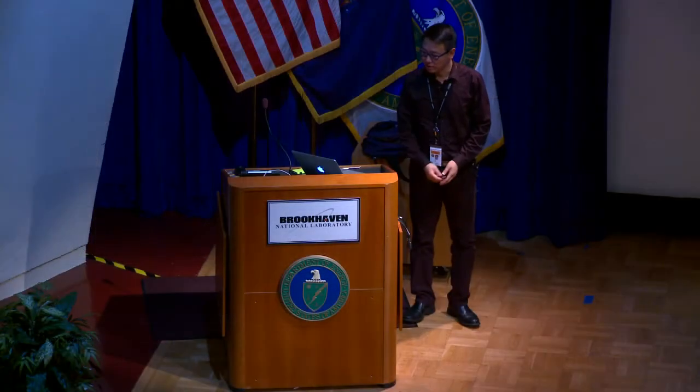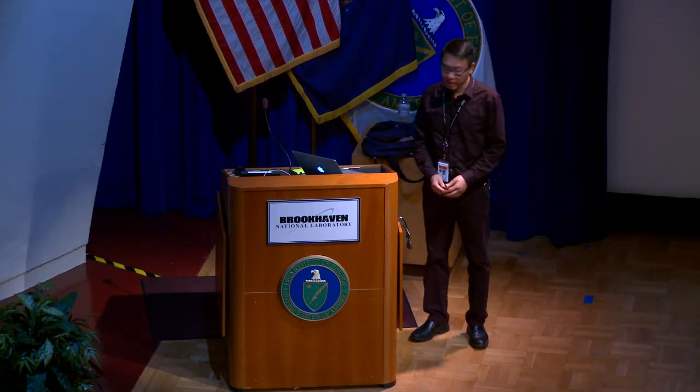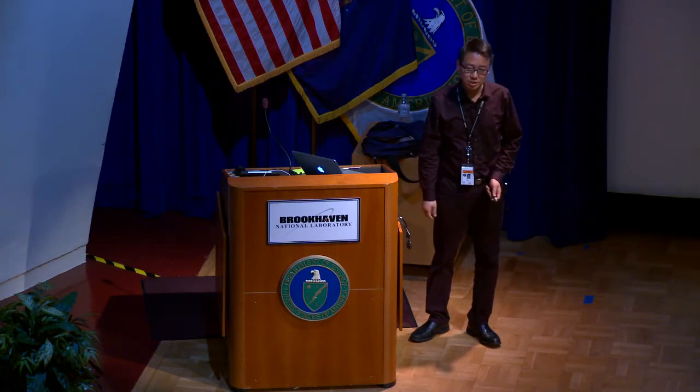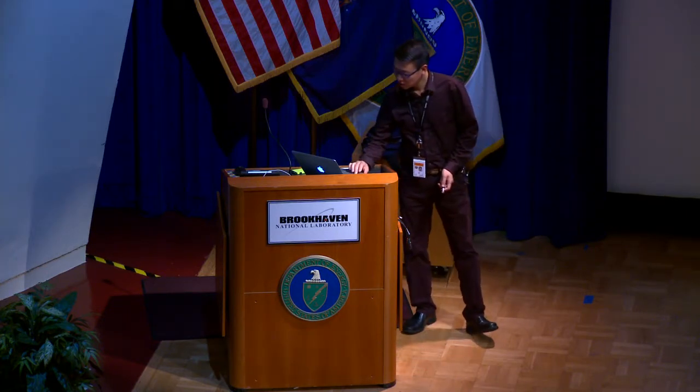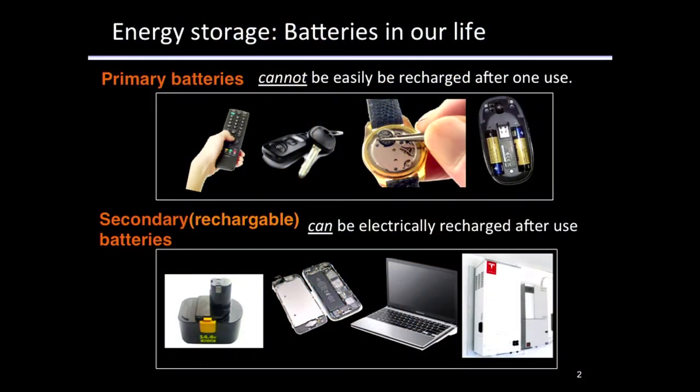This talk is about how we use the transmission electron microscopy method to study the electrode materials and their electrochemical reactions at a nanoscale. So we know battery is important to our lives. Here we show a few of the examples like our remote control, our watch, and our cell phone, laptop.